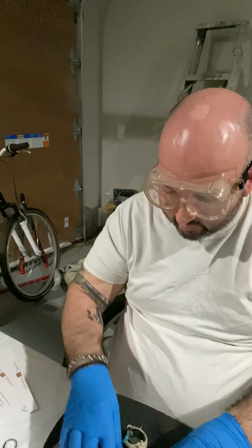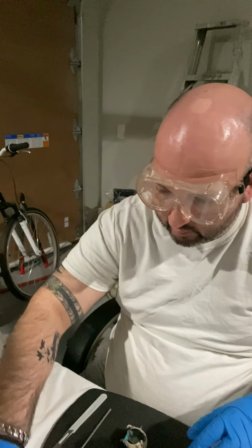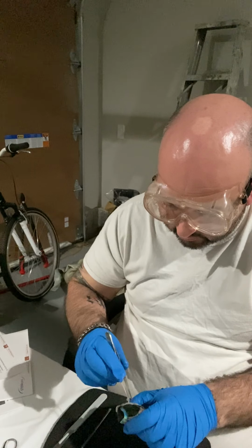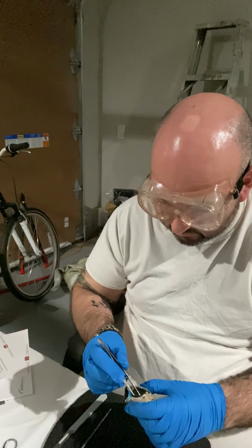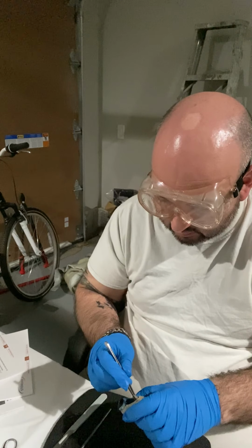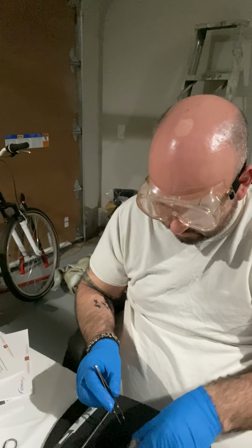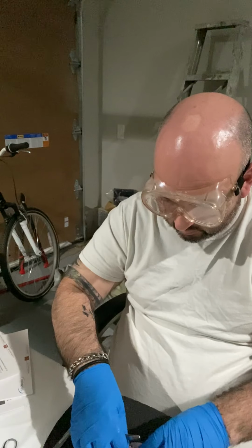Let's see if I can remove it just to make this a bit more visible without destroying this eye much more. Yes, this is definitely the vitreous humor because it's very much a jelly-like disc. Okay, here it comes.